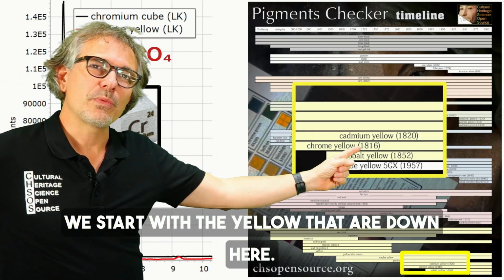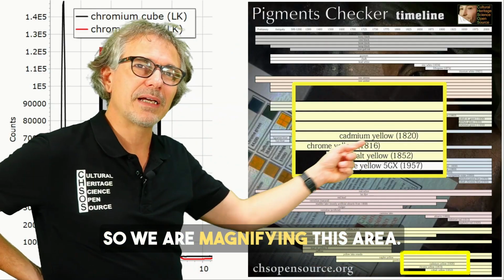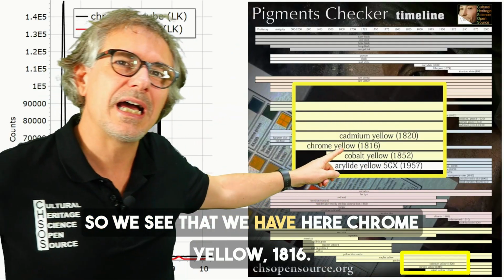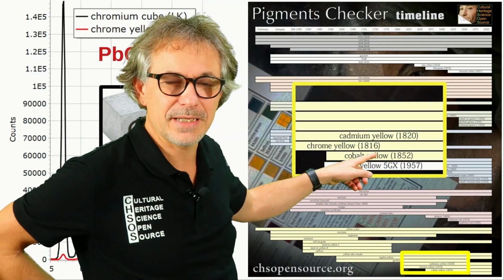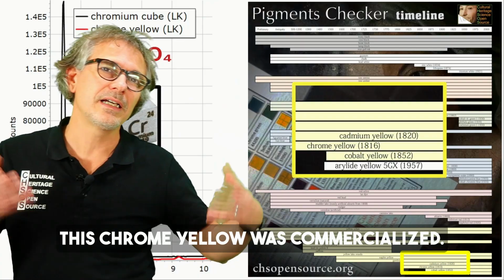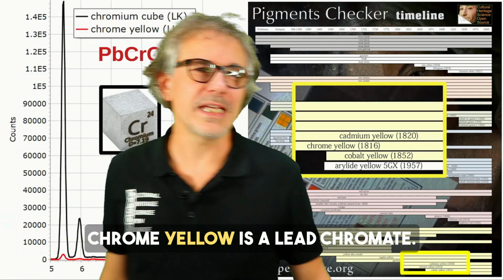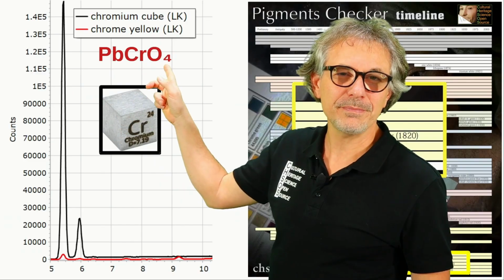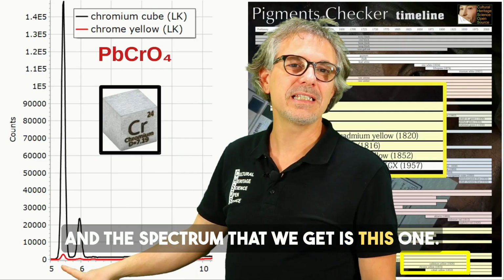We start with the yellows that are down here. So we are magnifying this area. So we see that we have here chrome yellow, 1816. So 1816 is the year when this chrome yellow was commercialized. Chrome yellow is a lead chromate, and the spectrum that we get is this one.